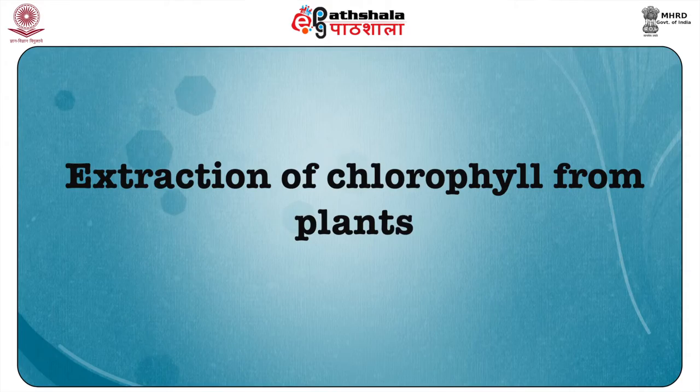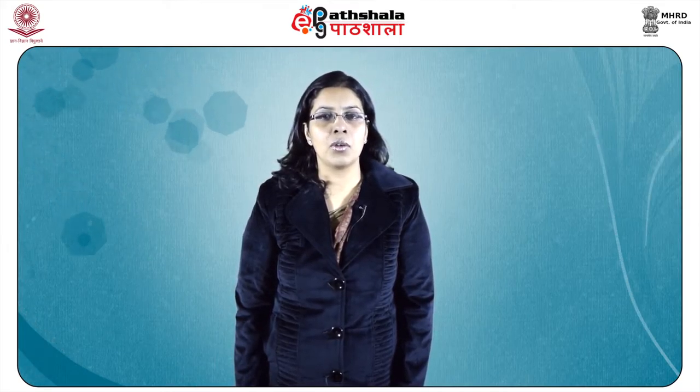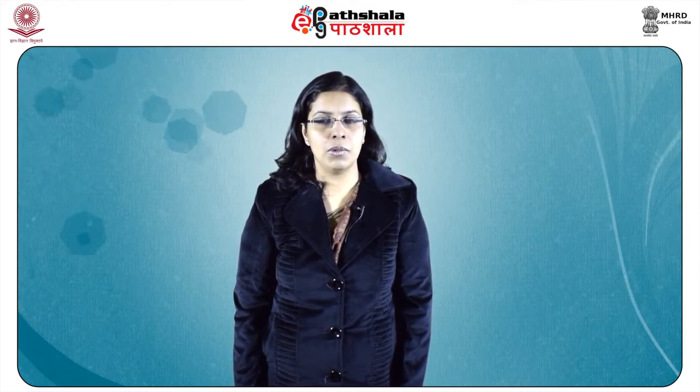Extraction of chlorophyll from plants. In plants, chlorophyll is associated with specific proteins. For example, chlorophyll A binding proteins are referred to as CP1, CP47 and CP43. With improving biochemical techniques for use on the membrane system, there has been an ever-increasing success in the isolation and characterization of these proteins. Initially, detergents are used to break down the membrane into fragments, and these fragments are further broken down by the use of different detergents.